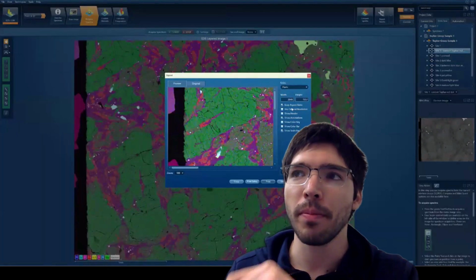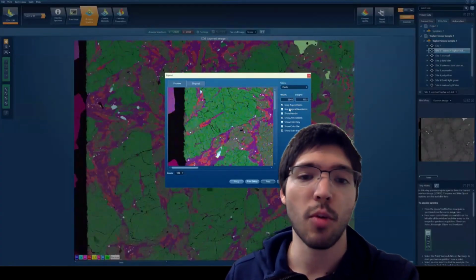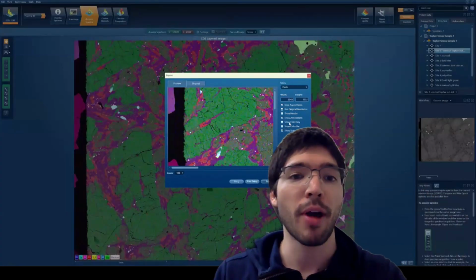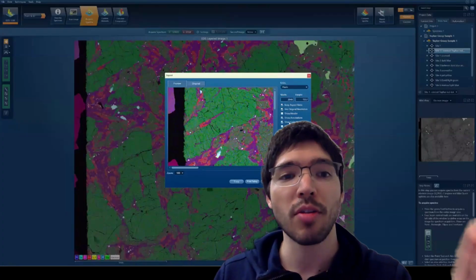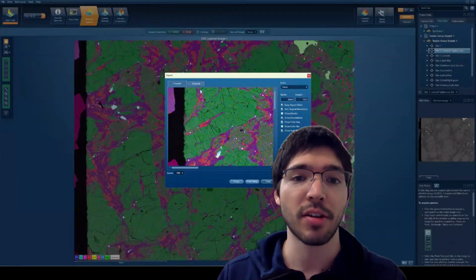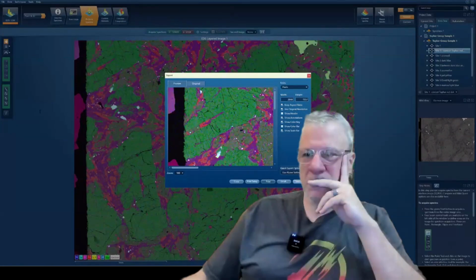The most important part of any data collection process and classification, whether through the scanning electron microscope, the electron microprobe, or any other instrument, is to ensure you have clean data when you're collecting it. Otherwise, if the data that comes in is not good, there's no way you can use it reliably for interpretation.